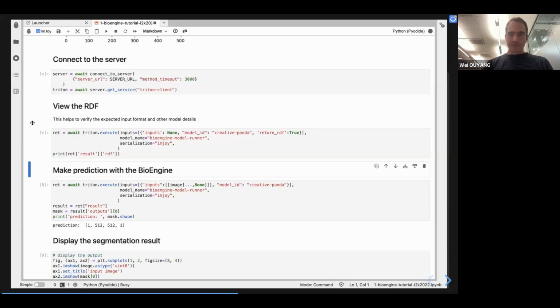It looks like we have. Yeah, we might can check. Does it work for everyone? Is anyone else managing to get stuff running? Because I think what's happening at the moment is we've probably all been running these cells, and yes.